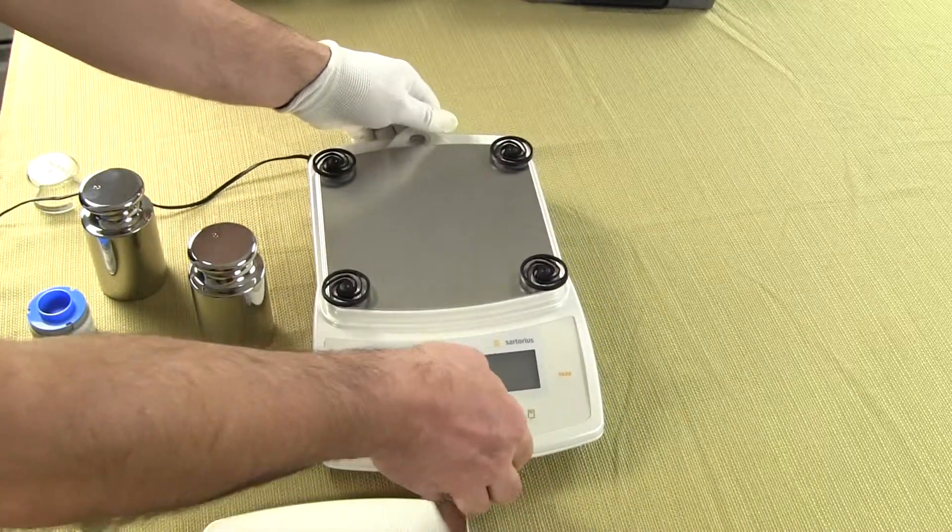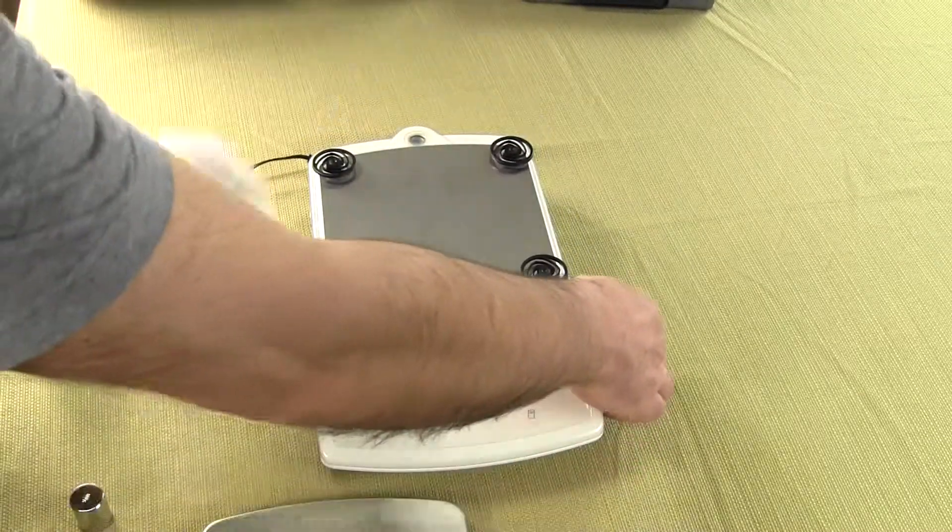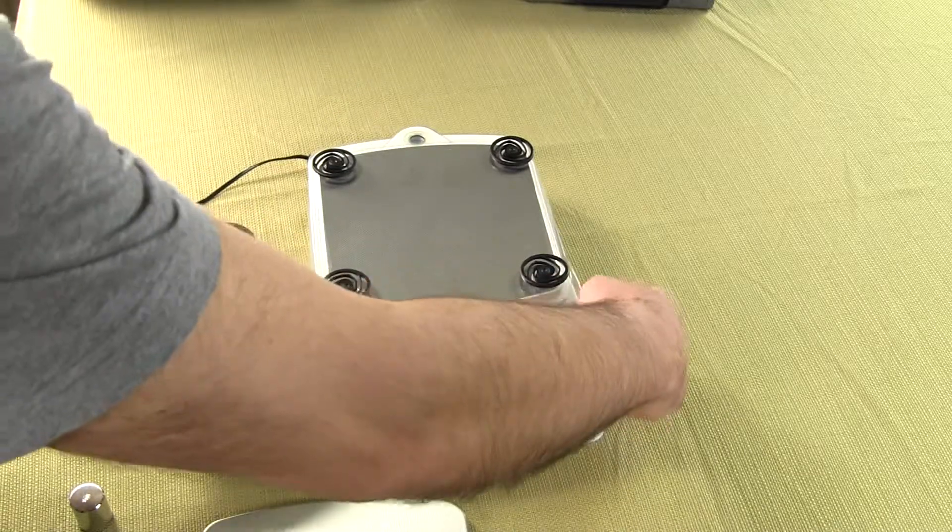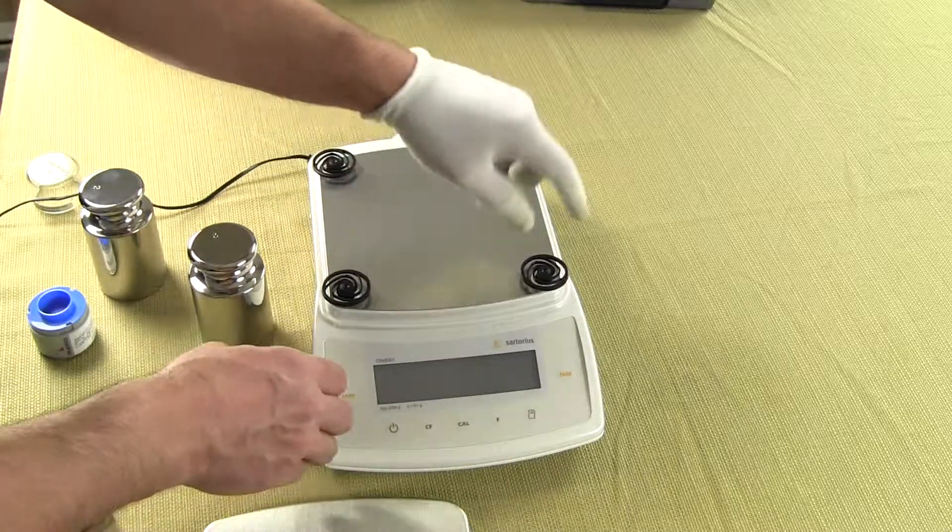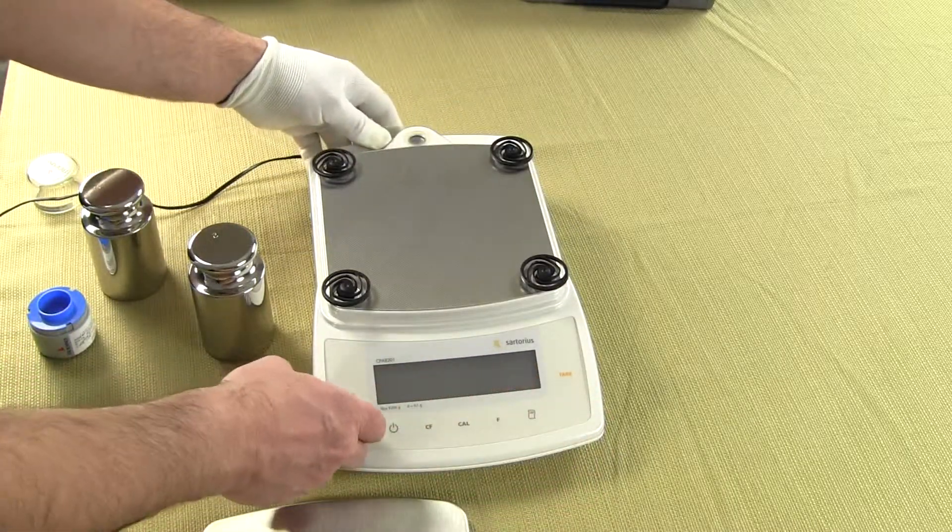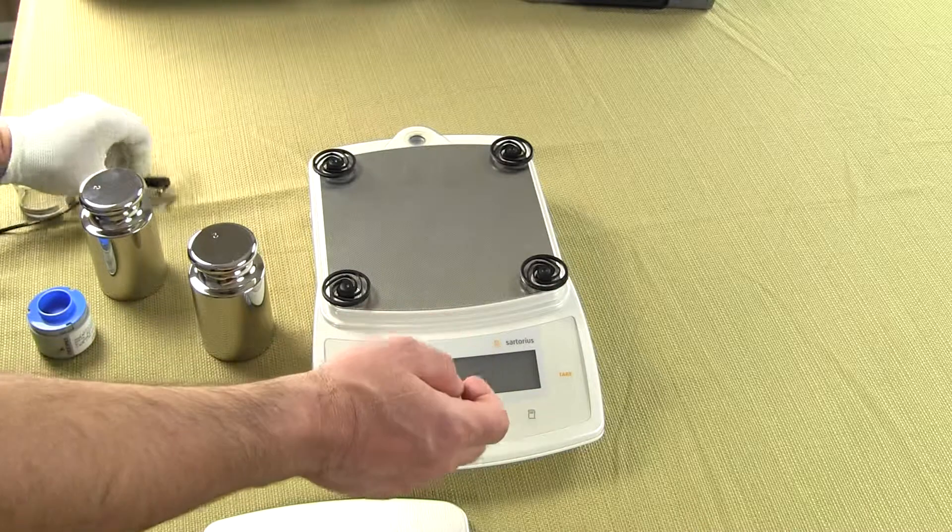The balance also comes with one splash shield. You can see this comes off and you get one of these with the balance. So this lifts right off. You have to pull off these four plastic tabs and it comes off. So that comes standard with the balance.